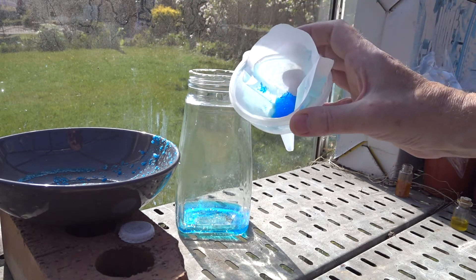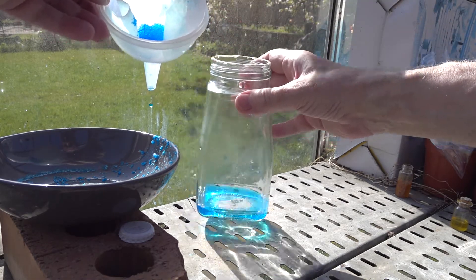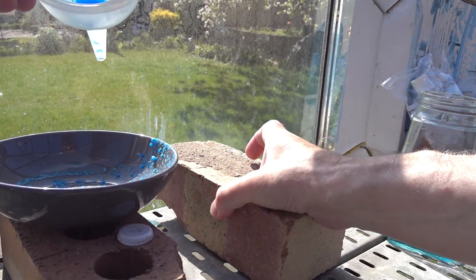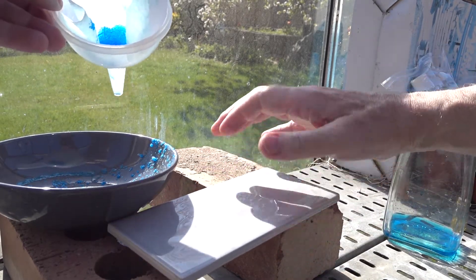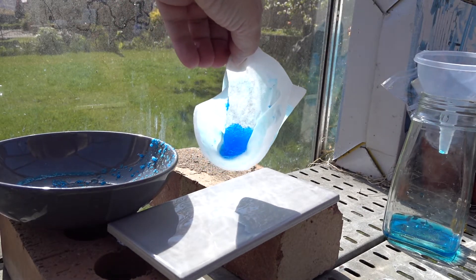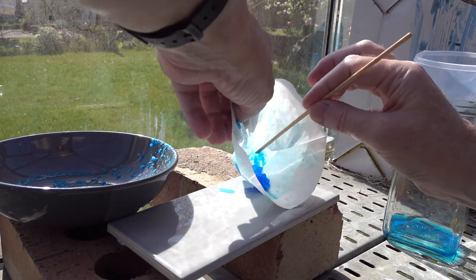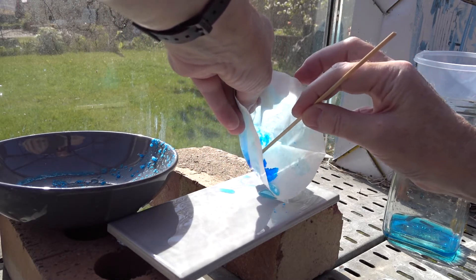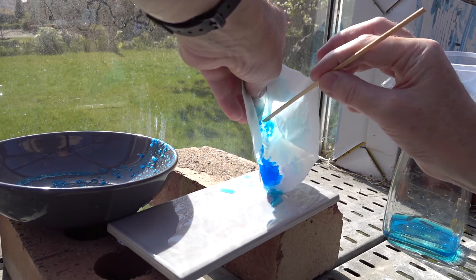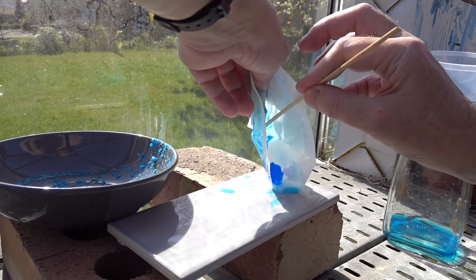Here are the filtered crystals of copper sulfate. Let's get them out of the filter paper and compare them to the crude material that we started with. We'll put the crystals, which are still damp, onto the tile here. Out they come — they're not dry. And we can in fact recover a lot more material from the filter paper and the bowl later if we need to.